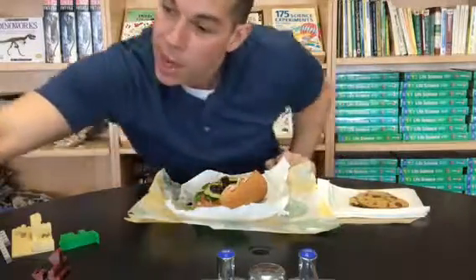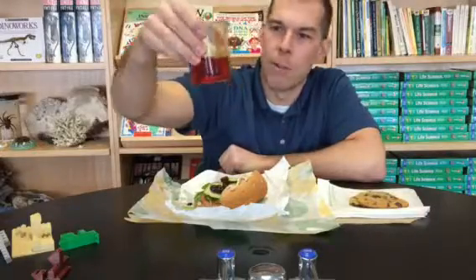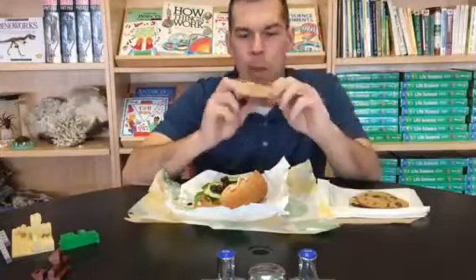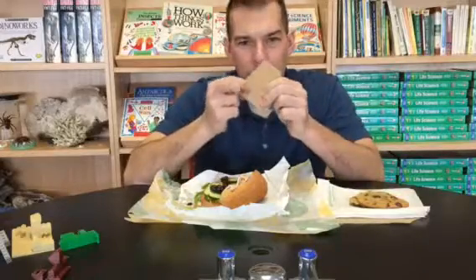And then we use the iodine, which when you put iodine on a starch or a carb, it's going to turn blue-black immediately. No heat on that. And then the fat test that we did was the old paper bag or cardboard box: when you rub it on there and it leaves a little greasy mark, then it's got fats in it.